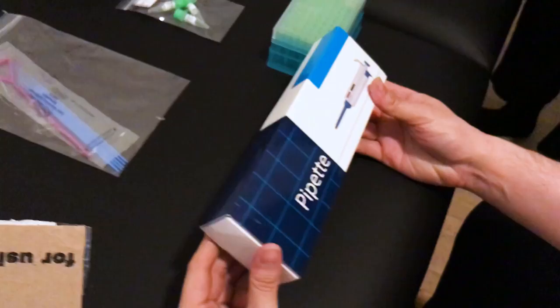We ordered a do-it-yourself CRISPR kit, it just arrived in the mail, and we are about to genetically alter a strain of bacteria. Let's get to it.